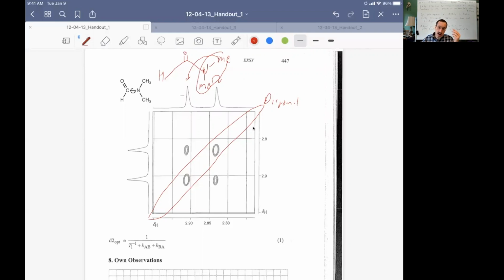This is the same problem that you'd have in your own research, or coming to a second year report or a paper, when somebody is trying to establish, is my compound pure? Well, if you can show that those two peaks are associated with the same molecule, you can show that they're not chemical impurities and also get a better understanding of the dynamics of the molecule.